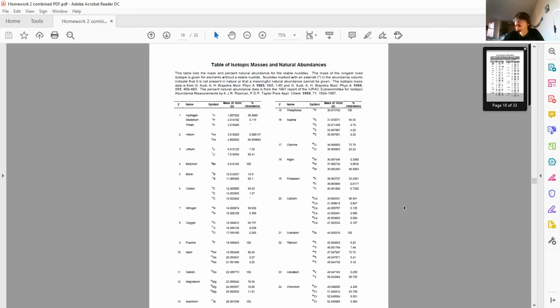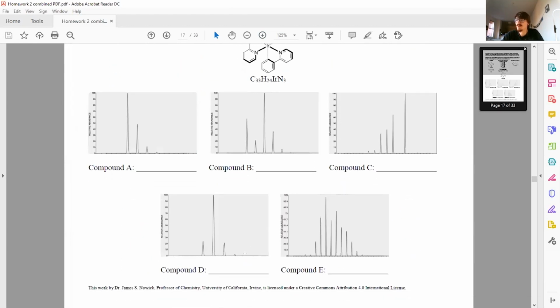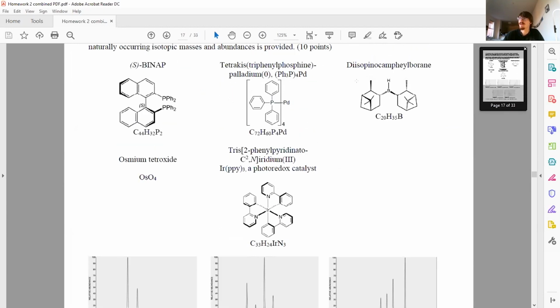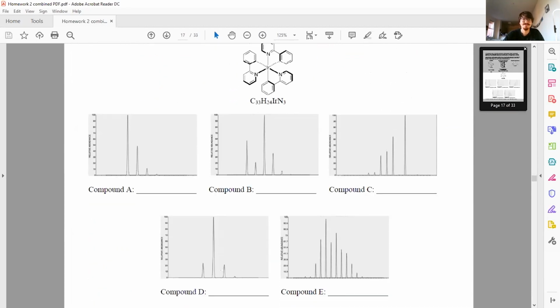And if we look at the isotopic abundance for boron, M would be boron 10, which is roughly 20 to 80 to the M+1. But in the boron spectrum, we see that there is an M+2. Same explanation. This boron containing compound has a good number of carbons that could contribute C13 to M+1.